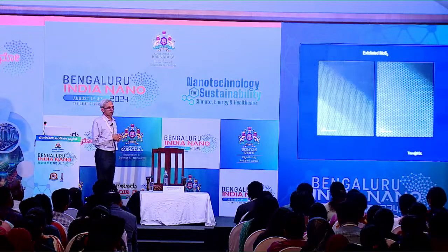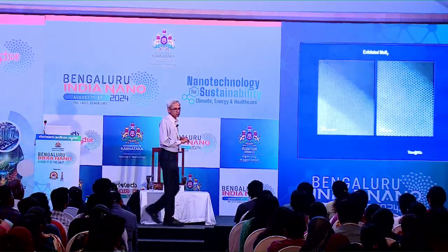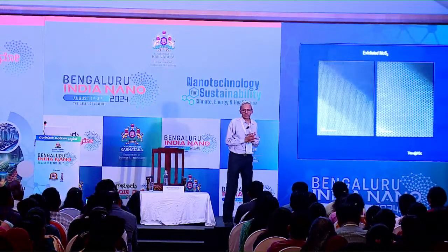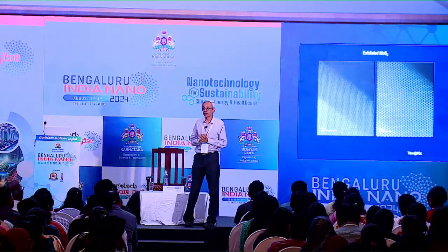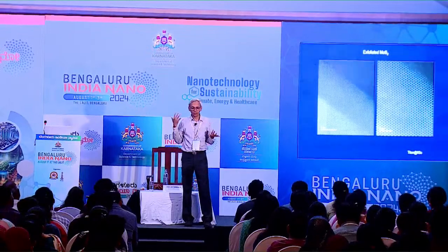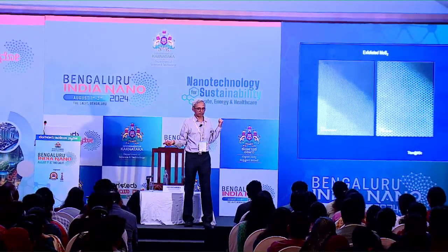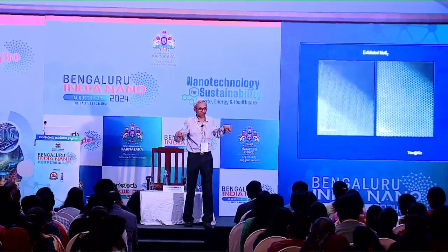This is a monolayer structure of MoS2. This is the kind of thing that we are able to get at our facility. In this particular case, I should tell you that you're only seeing the higher atomic number element. You don't see the sulfur, the lower atomic number element. You are only seeing molybdenum, because only molybdenum actually scatters electrons.